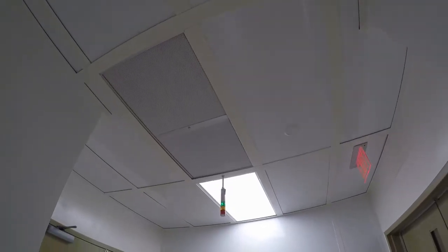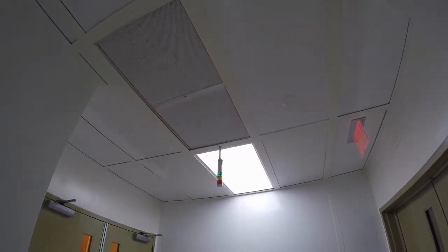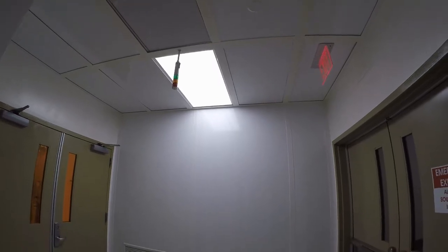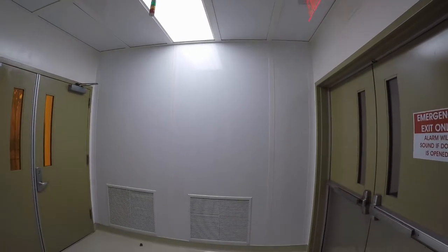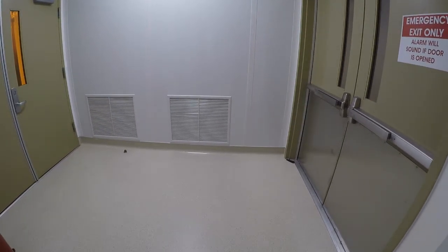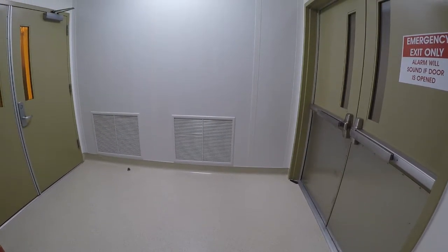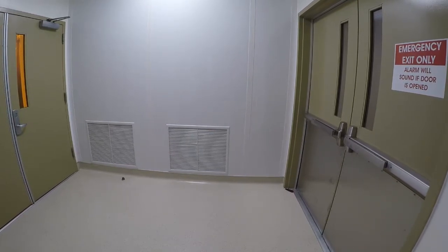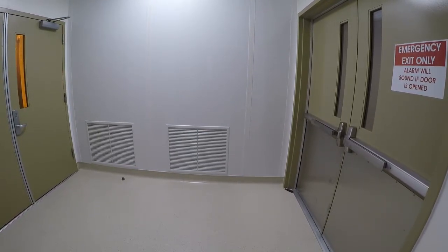To prevent these particles from entering the cleanroom, air is pumped downward through HEPA filters in the ceiling, maintaining a higher pressure inside the lab. This results in a constant flow of particle-free air from inside to outside of the cleanroom, keeping particles from entering the lab through small cracks and door jambs. Even with a constant flow of filtered air from inside the cleanroom to the outside world, particles can still find their way into the space.